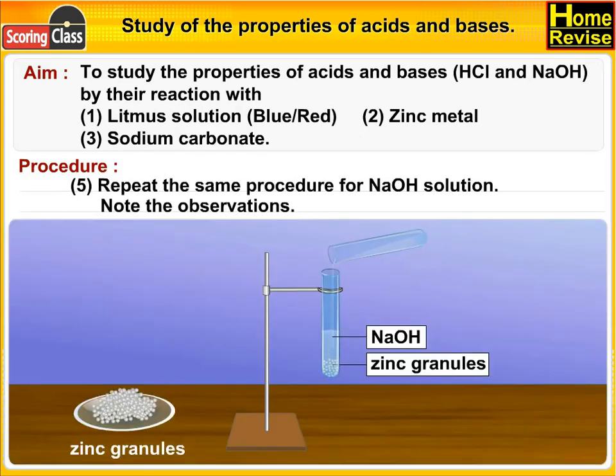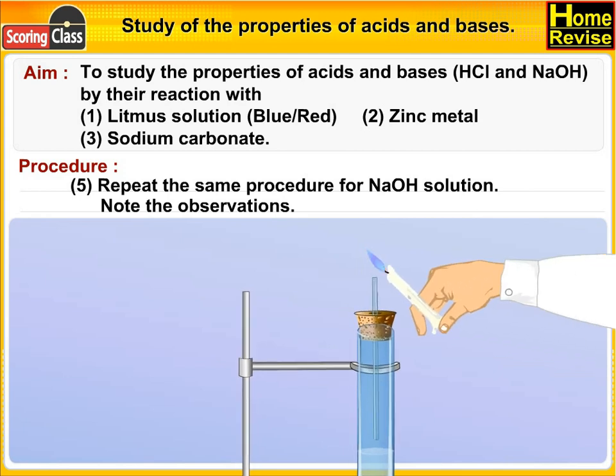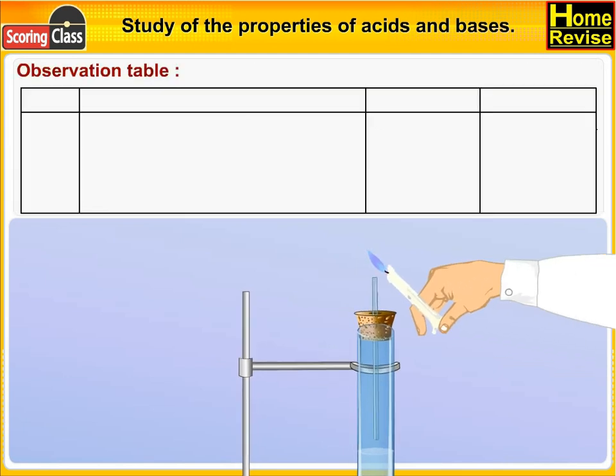Now repeat the same procedure for NaOH solution and note the observations.